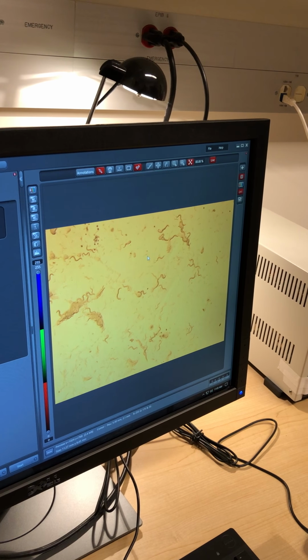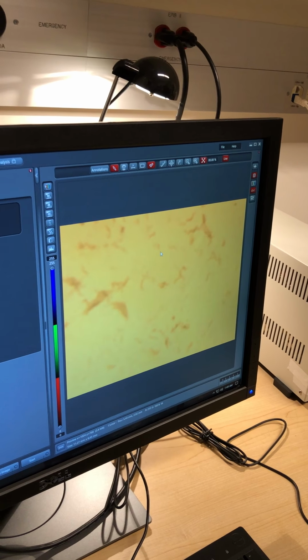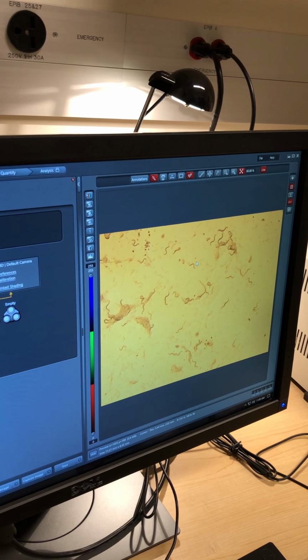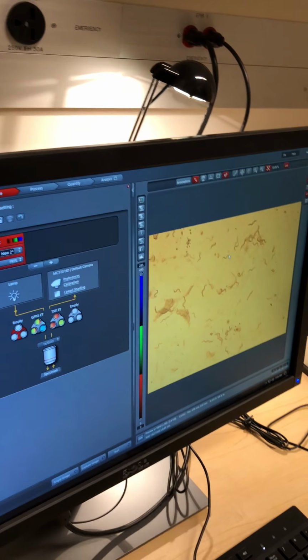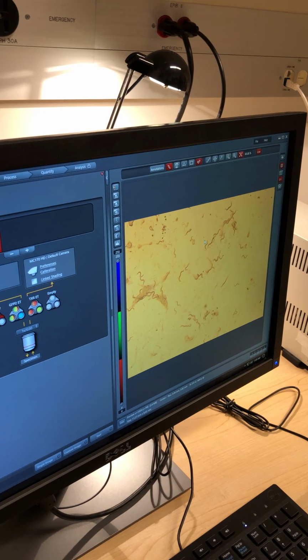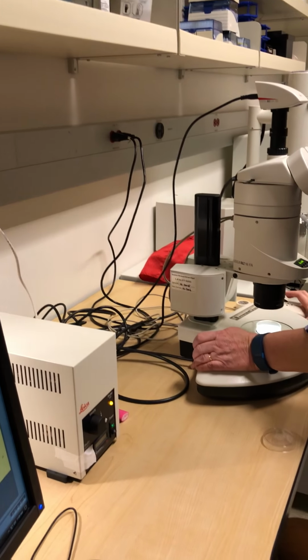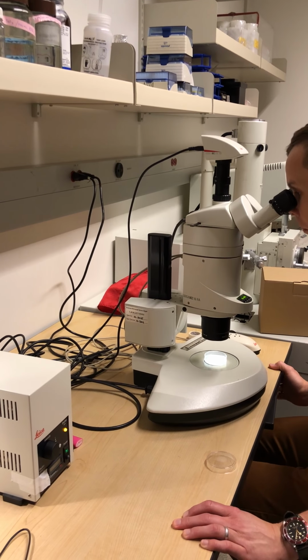That's right. There's a Bayer mask or Bayer filter in front of the sensor. And the camera is not at the same focal plane as the eyepiece. It's not magnified either, I would assume. Well, there is a lens in the C-mount which is reducing the field of view from the eyepieces so that it matches the chip size. Is the focal plane slightly off? Yeah, if you look, it is out of focus.